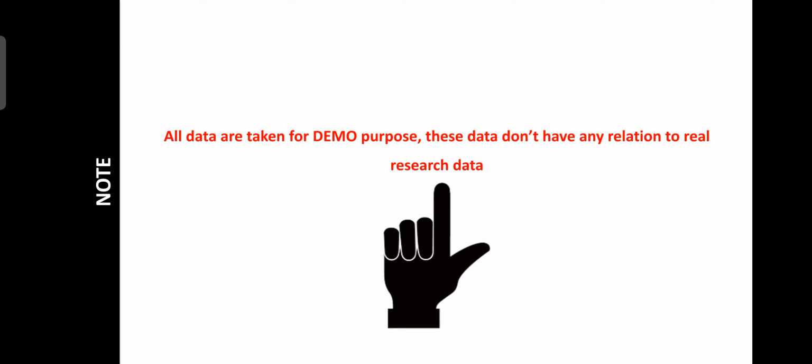Here all the data are taken for demo purposes. These data do not have any relation to real research data.